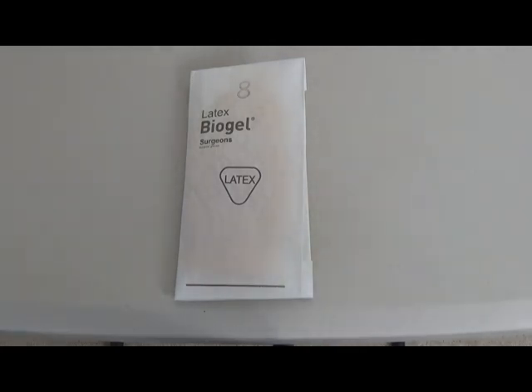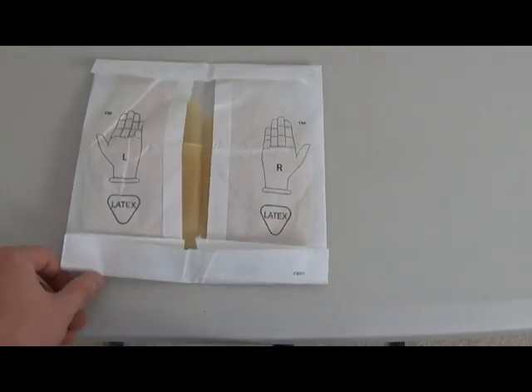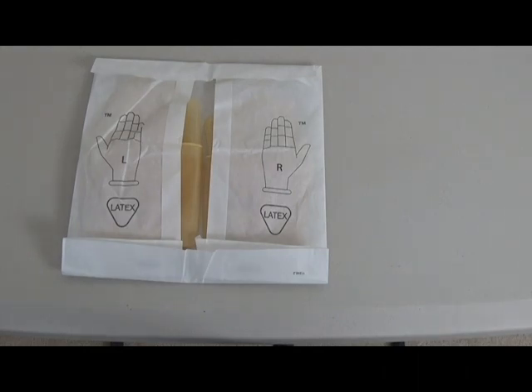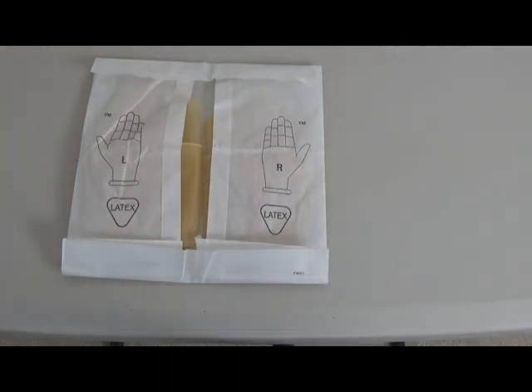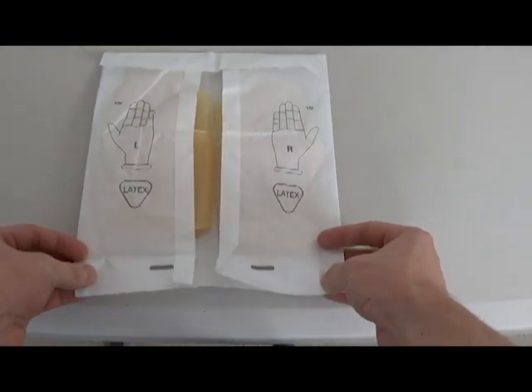I'm gonna show you how I do it, and as I go along, I'll show you the common mistakes that I have seen happen. Okay, so here we go. First thing you do, open it. The inside right here is obviously sterile, and I'm gonna try to keep it that way. The best way is to use the edges right here to open it up without touching the middle. So the first thing I do is undo the folds that are at the bottom.